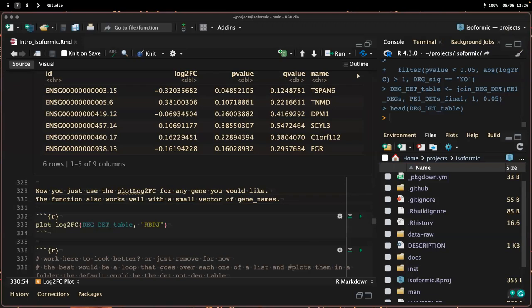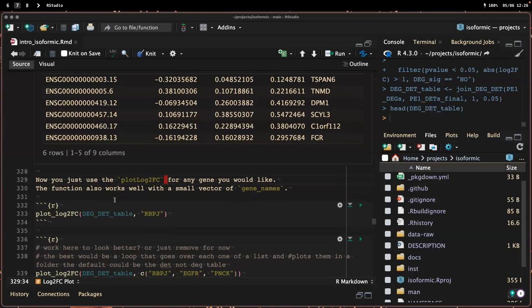Awesome. So I think more and more people, especially at the biology level, are thinking transcript, because more and more people are analyzing their own data, and whether it's single cell seq and they're using Alevin-fry, or they're using bulk seq and they're using Salmon, because the CPU requirements of STAR are just too high for most people who are just doing a one-off, right? If you're doing lots of stuff, okay, you set up a little EC2 instance or something on a cluster and you're good to go.